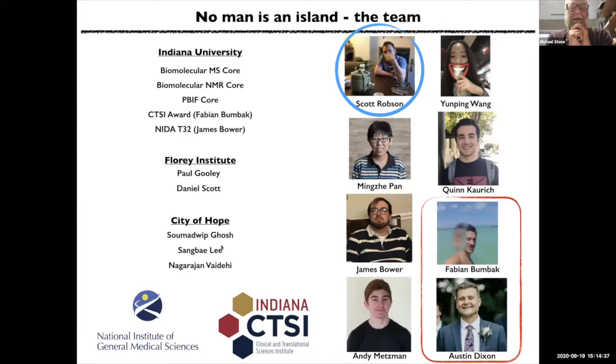The question is, are your conformation diagrams showing allostery? Won't a new funnel coming up only upon ligand binding give a more accurate representation of allostery? In the absence of a ligand, the protein doesn't exist in the other conformation. Or will they have equal populations, such as in futile conformations? So can you comment on whether your data is showing allostery?